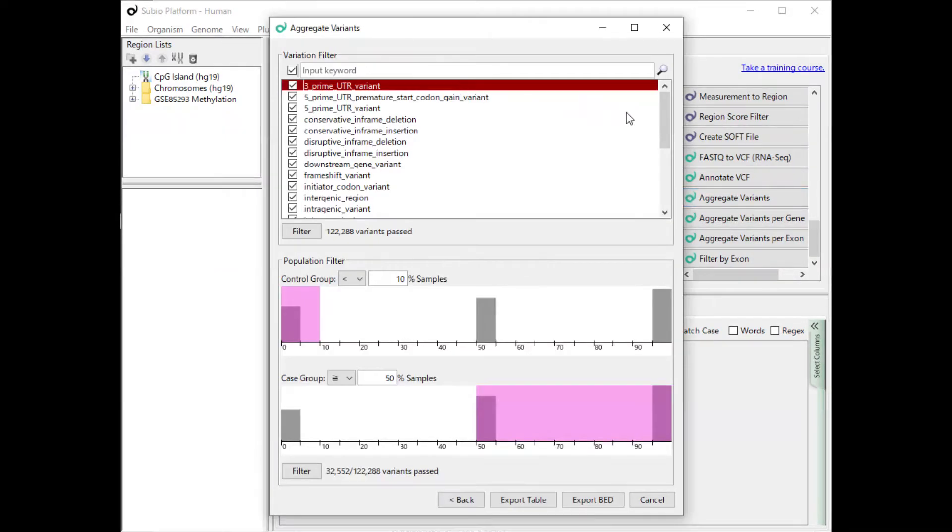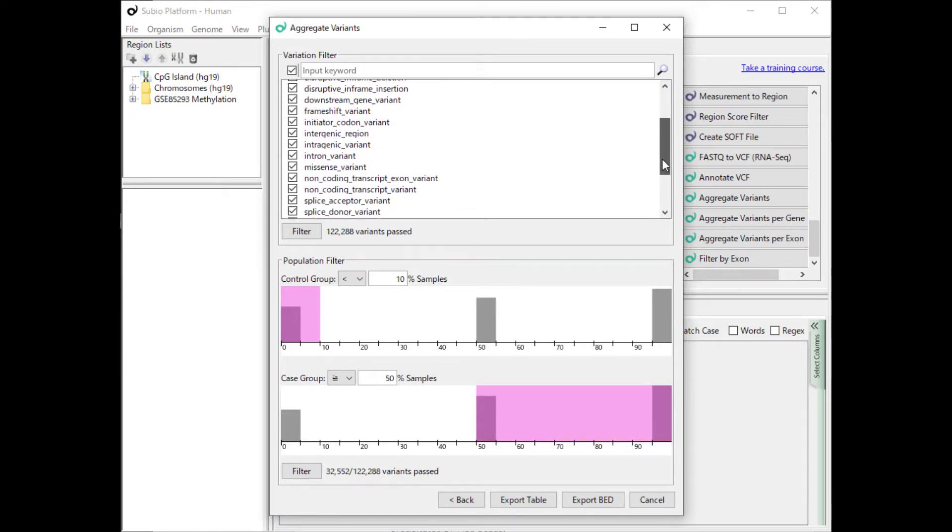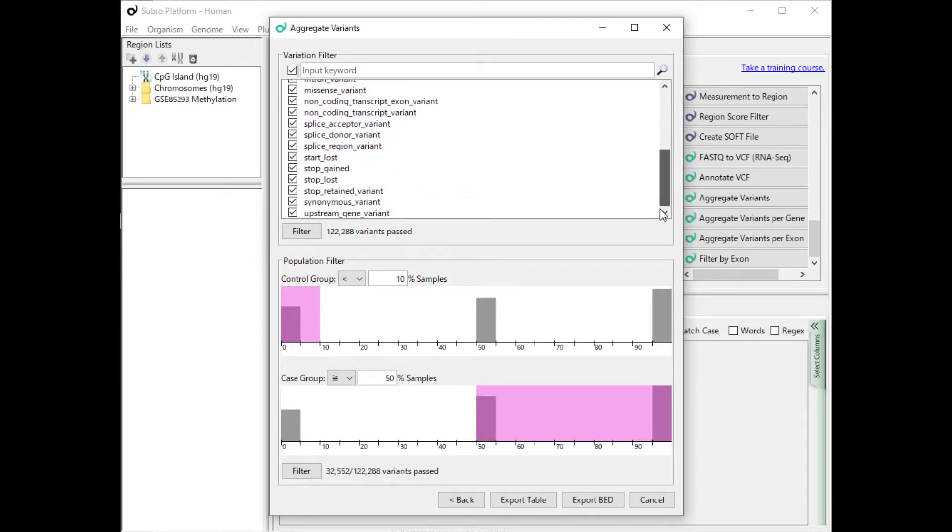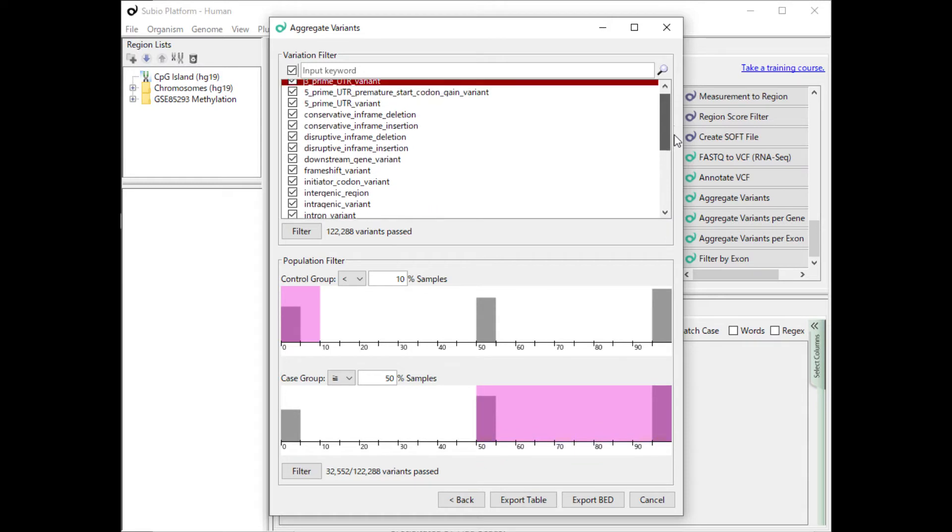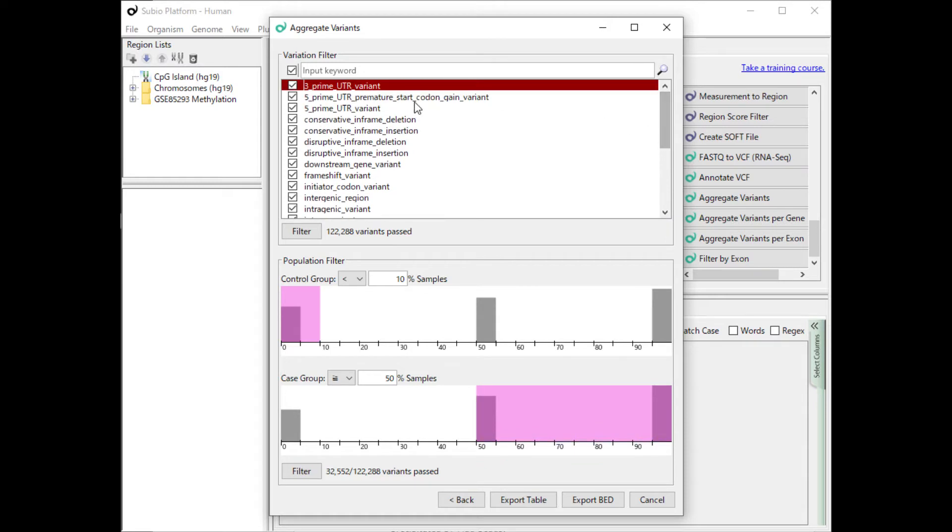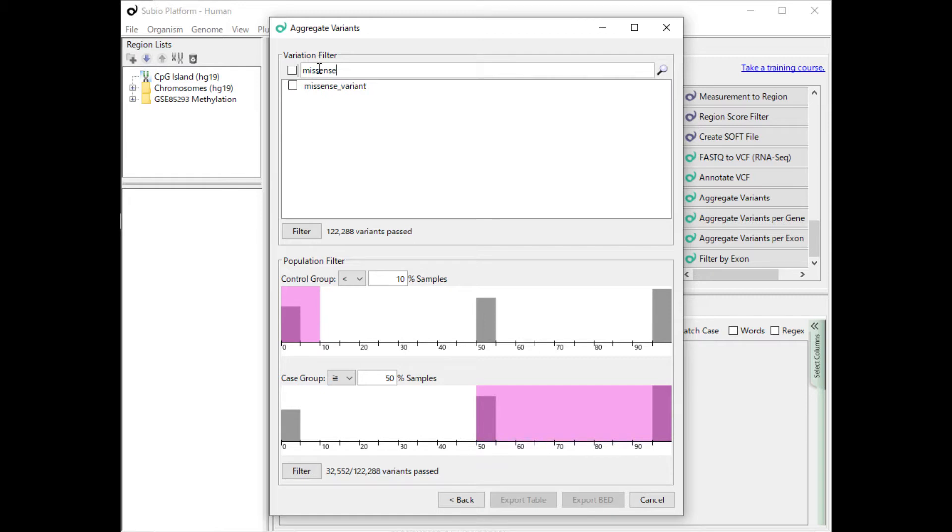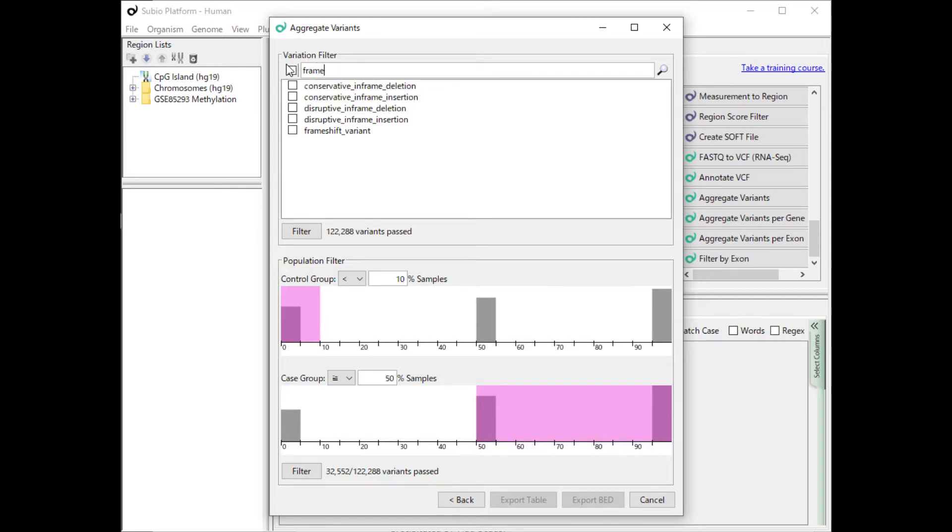At the top of the results screen is a panel where you can filter by mutation type. If you are not interested in all mutation types, select the mutation types to be analyzed. Use the keyword filter to make the selection easy.